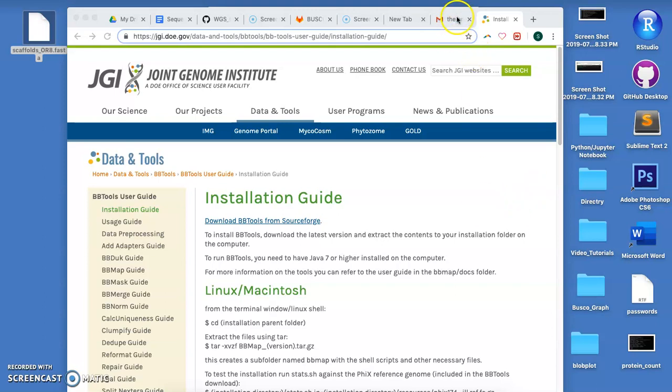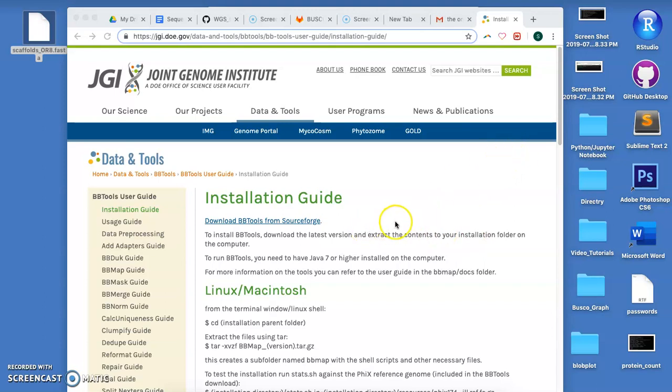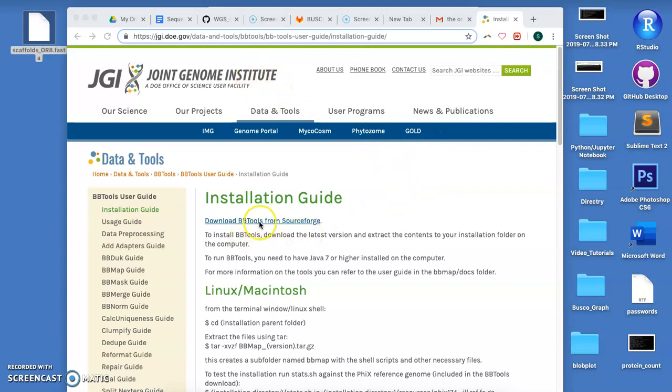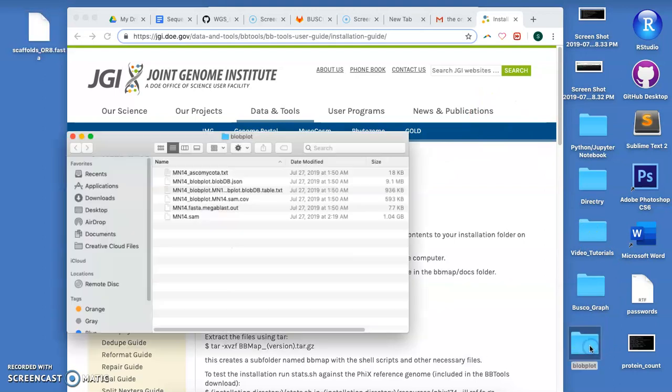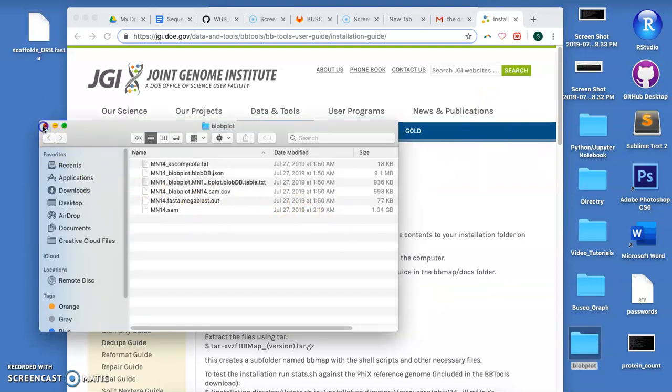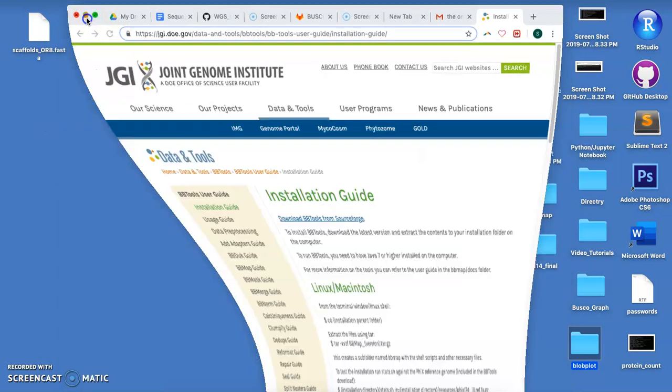Okay, so the first thing you do, I don't know how to run this one on the cluster, I only know how to run this on my own personal machine. So what you do first is you go to the JGI Institute website and you're going to download BB tools.